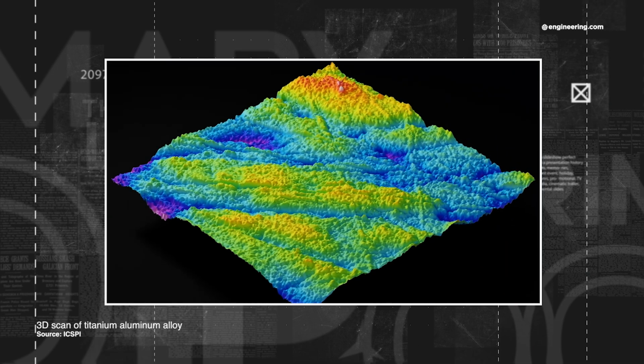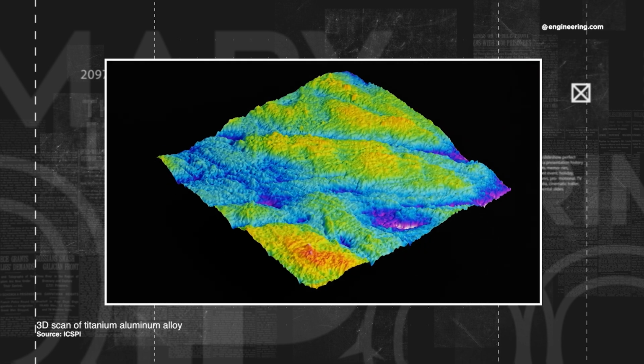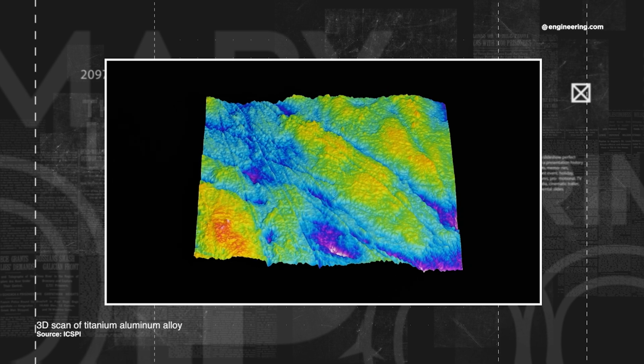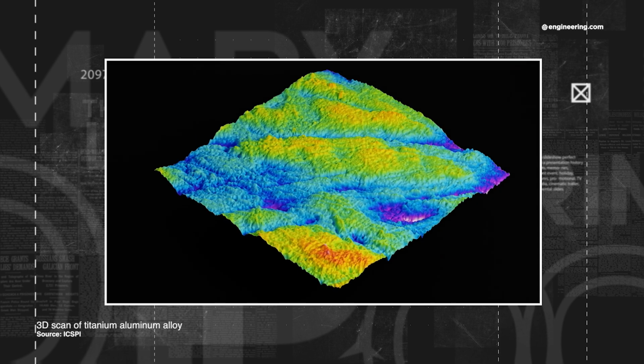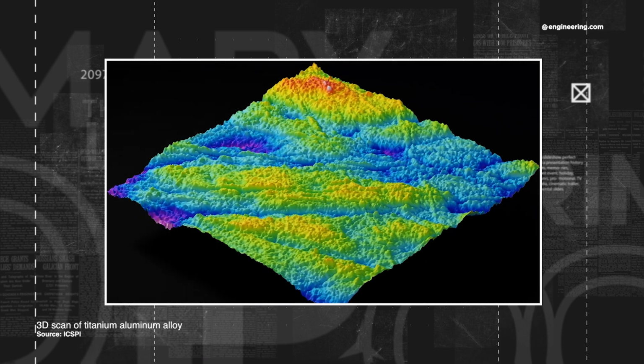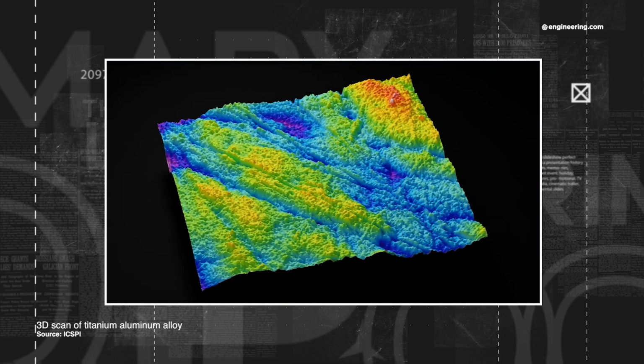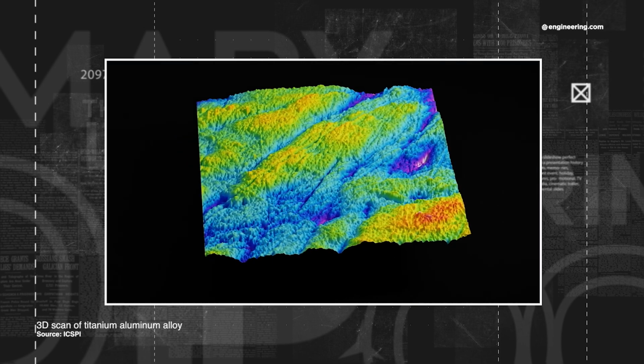Using a metallographic microscope, you're not really able to resolve the scratches necessarily. And what AFM really shines at is getting that three-dimensional data. So you can look at the scratch patterns. You can get the actual height and depth information of those scratches. You can look at grain boundaries, and we can look at those really small components.